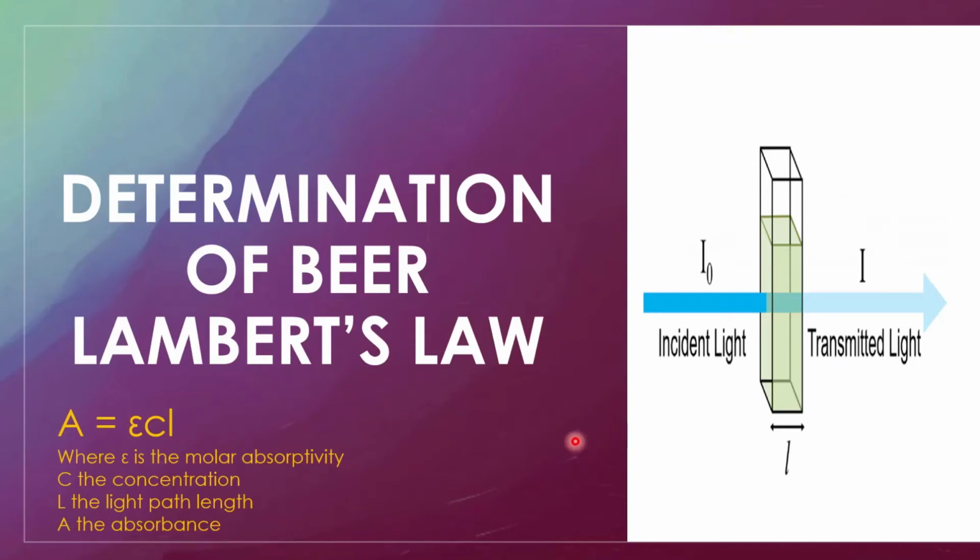In today's video and class, we are going to perform an experiment using Lambert's law to determine the concentration of our indicators, and this happens to be the methyl orange and the methylene blue in the unknown mixture.